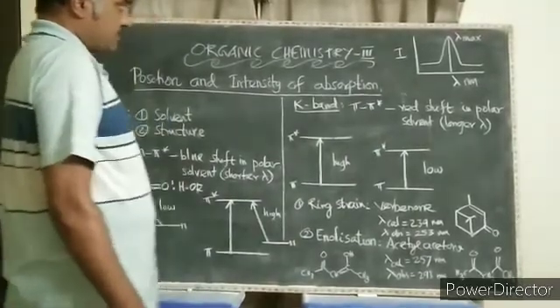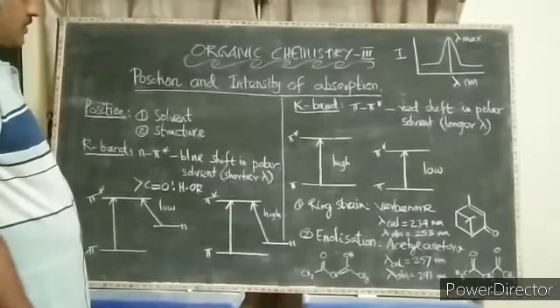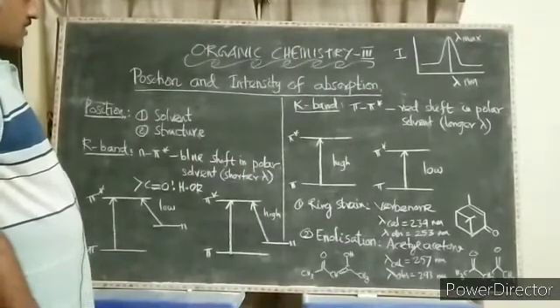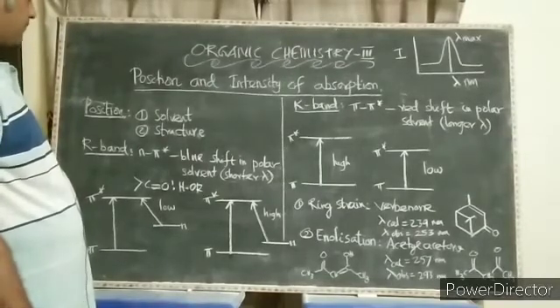This lambda max is a characteristic of a substance, and from the lambda max we can find out information about the substance.